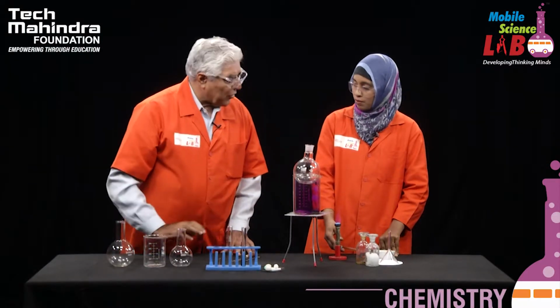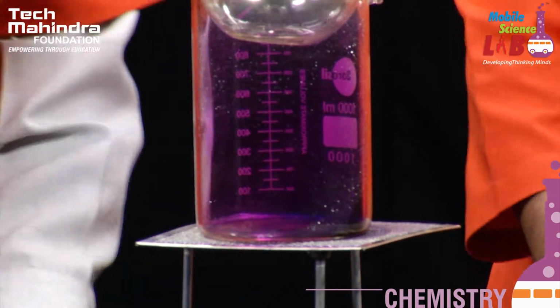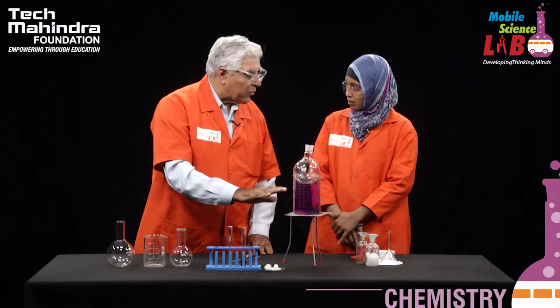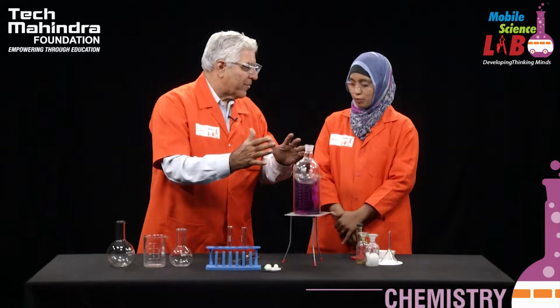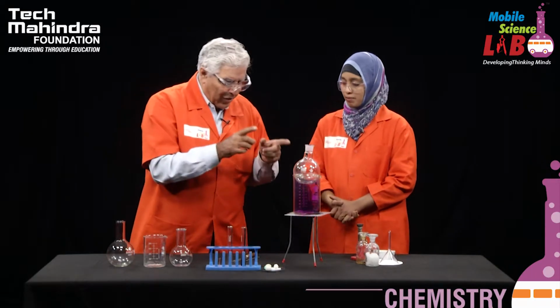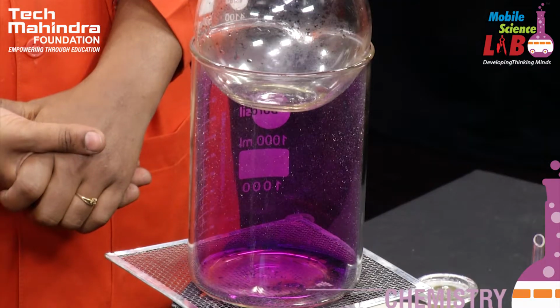We will keep this for a little while. Yes, sir. And one more thing you will observe, viewers, and you will also see, Khatija, as the temperature cools down, the intensity of that violet color will decrease and the quantity of the crystals will increase. Yes, sir, because those vapors will convert into solid again. Exactly right. So solid getting converted to vapor, vapor on cooling getting converted back to solid.